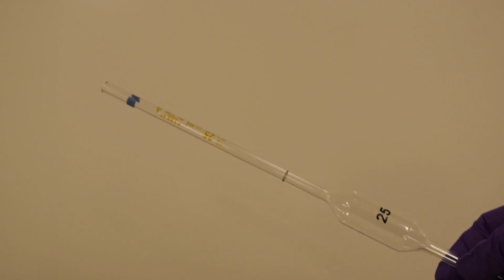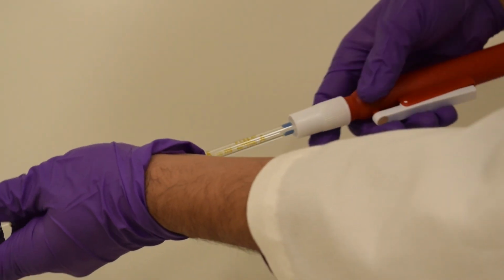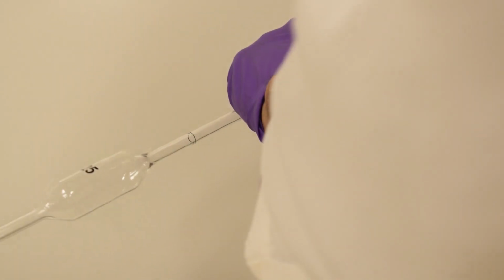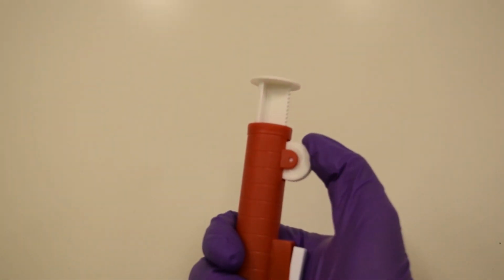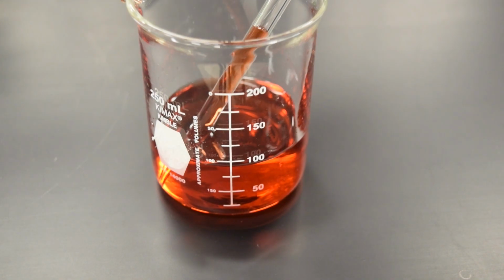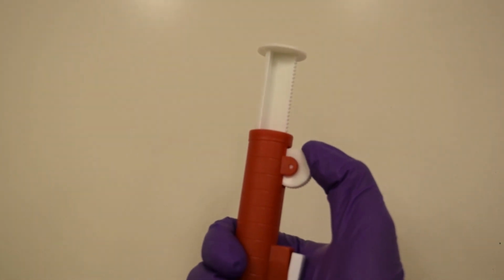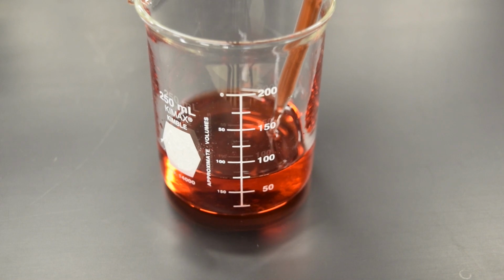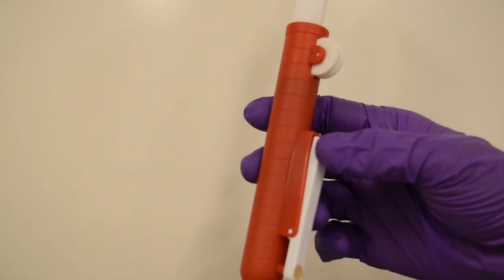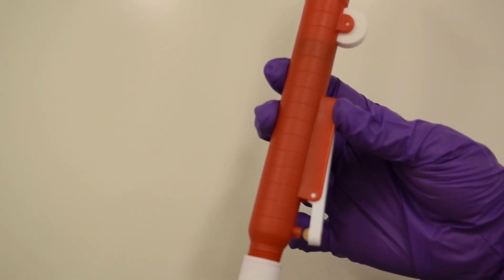Here's how to use the pipet. First, attach a pump to the top of the pipet. Twist the locking end of the pump to create a seal. Rotate the gear to create suction. This will add liquid to the pipet. Make sure to clean the pipet by adding solution to the pipet, then disposing the liquid into a waste container. You can press the release valve to release the liquid from the pipet.